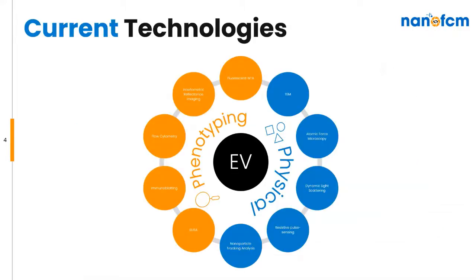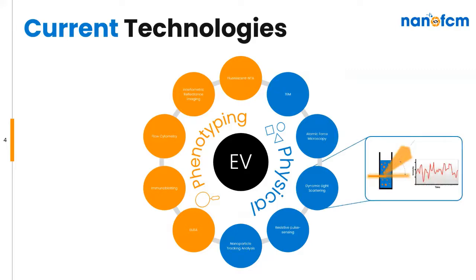So before delving into our nano flow cytometry platform, I wanted to start with an overview of different technologies applicable to nanoparticle analysis. This will help highlight the need for a platform and the position that it fills. On this slide, I'm sure you can identify a number of bulk analysis techniques such as immunoblotting and dynamic light scattering. However, to keep pace with the direction that modern therapeutics and diagnostics are heading, bulk analysis techniques are not enough. Single particle analysis is essential to answer crucial questions about your particles.